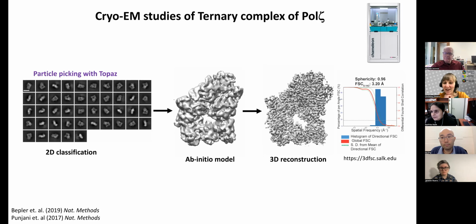All right, we have a question here from Miriam about combining data sets. The question is, did you have any issues with duplicate particles or issues with anisotropy when you're combining multiple data sets? So yes, we do have issues with duplicate particles, and we do end up removing them in our processing pipeline.